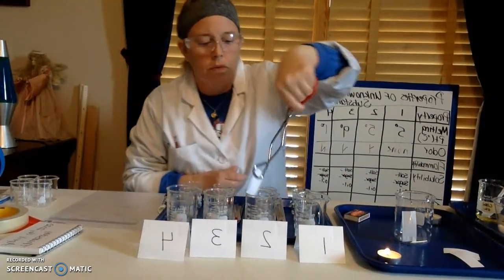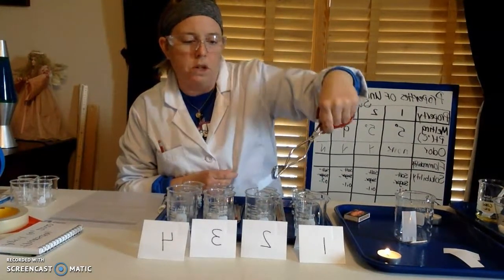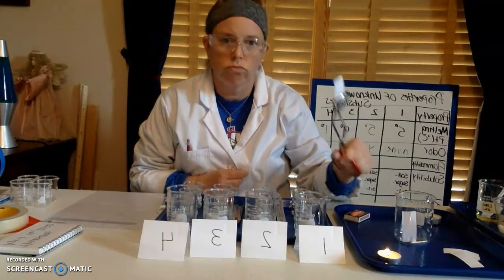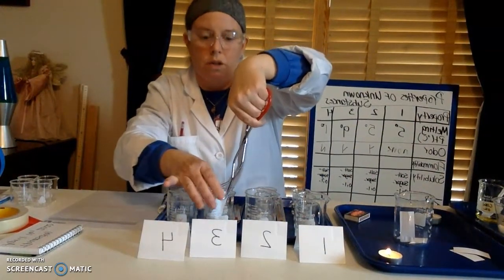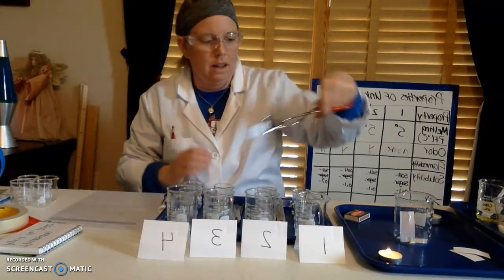How about number 2? Place a portion of that. Try and get that paper saturated. And let's see what happens with number 2. Nothing. All right, moving on to liquid number 3. I know, disappointing so far, right? You know what's going to happen. Come on.